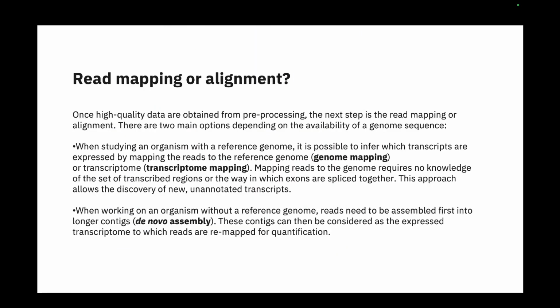Okay. So as I was saying, after you have generated your read file, now the question is, do you do an alignment or direct mapping, or do you try to assemble without a reference? That depends on the availability of your reference. When your reference is available, it is always better to go with a read alignment algorithm, because those will be less intensive in terms of computational power and also time and resources.